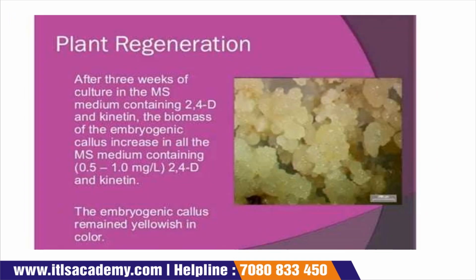Now the next is plant regeneration. After 3 weeks of culture in MS medium which contains 2,4-D and kinetin, the biomass of the embryogenic callus increases in all the MS media with kinetin.